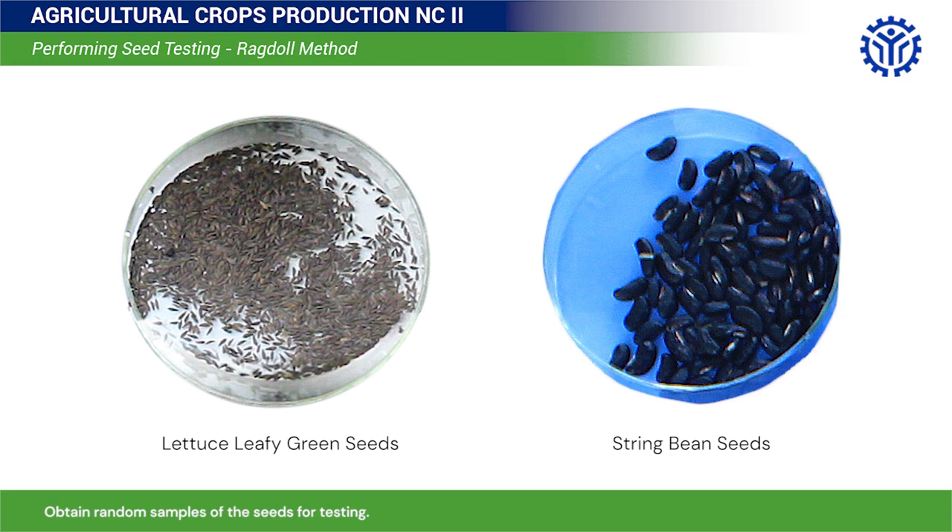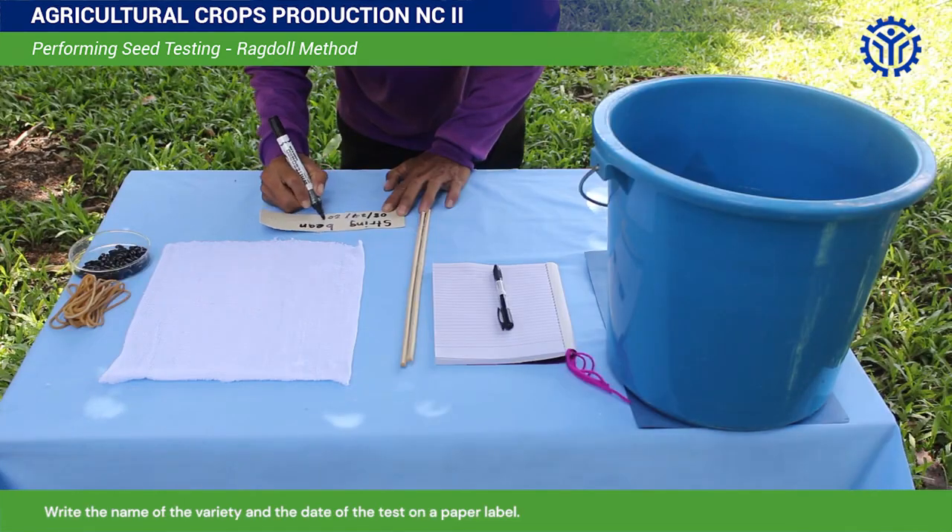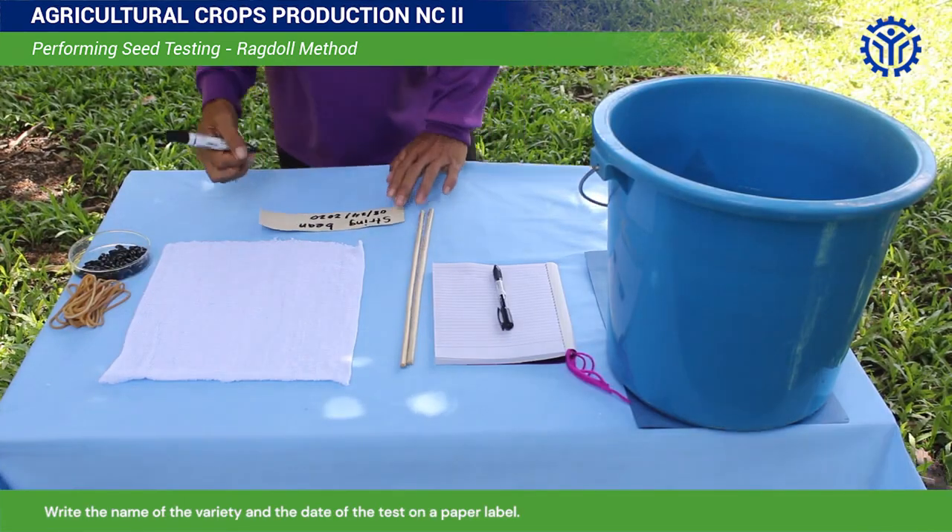Obtain random samples of the seeds for testing. Remove the empty ones from the sample — you should have a total of 100 filled seeds. Write the name of the variety and the date of the test on a paper label.